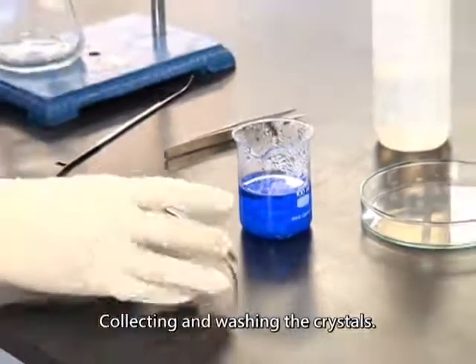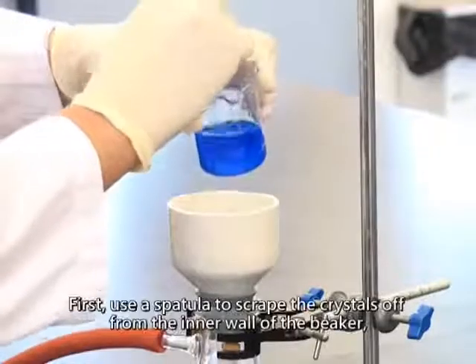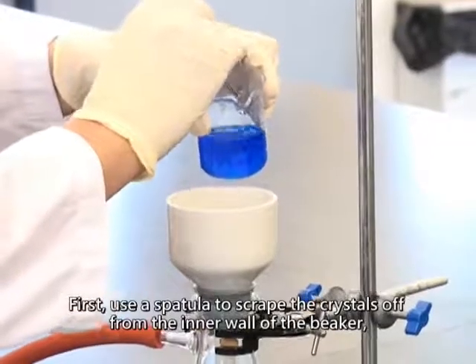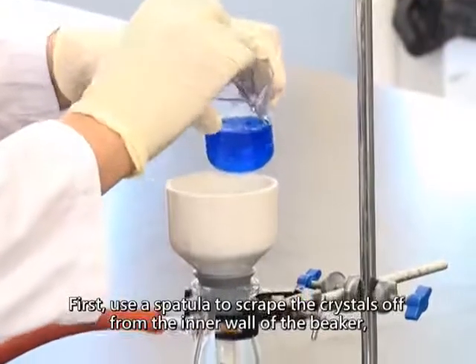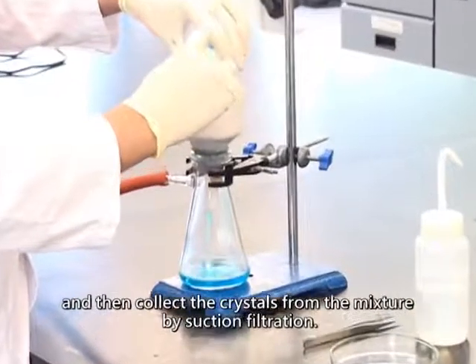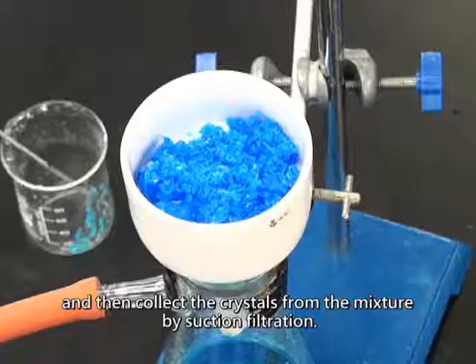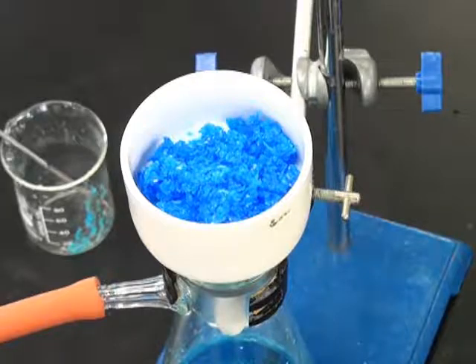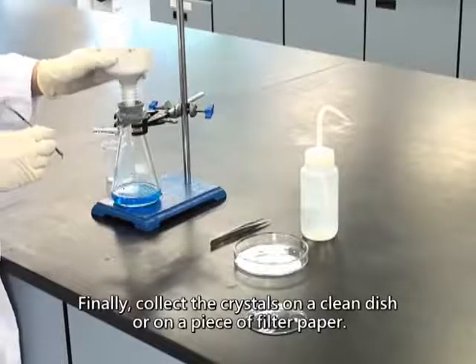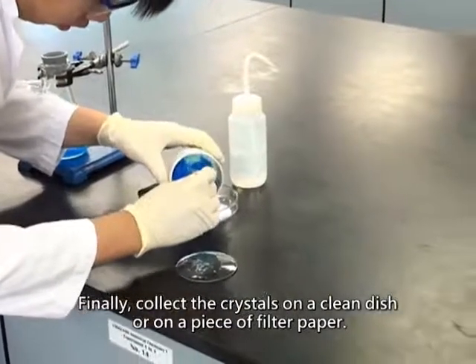Collecting and washing the crystals. First, use a spatula to scrape the crystals off from the inner wall of the beaker. And then collect the crystals from the mixture by suction filtration. Finally, collect the crystals on a clean dish or on a piece of filter paper.